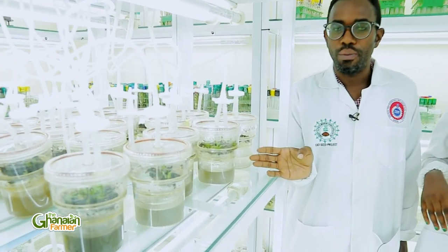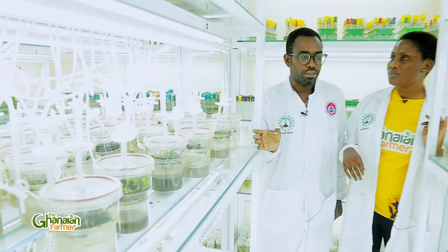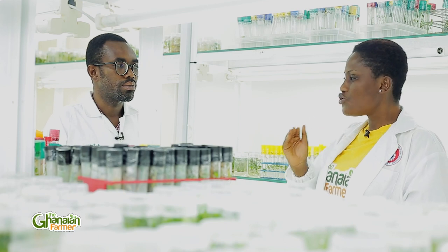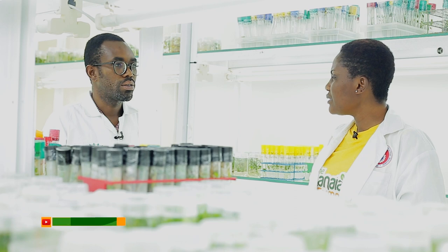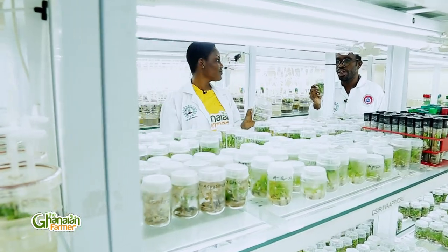When we talk about tissue culture, what we want to say is growing cells or parts of an organism in an artificial medium for them to grow. Plant tissue culture in agriculture means getting a plant part, bringing it to the lab, cleaning it, and making it grow in glass. Then, after doing everything, sending it back to the field for the farmer to get their planting material to grow.